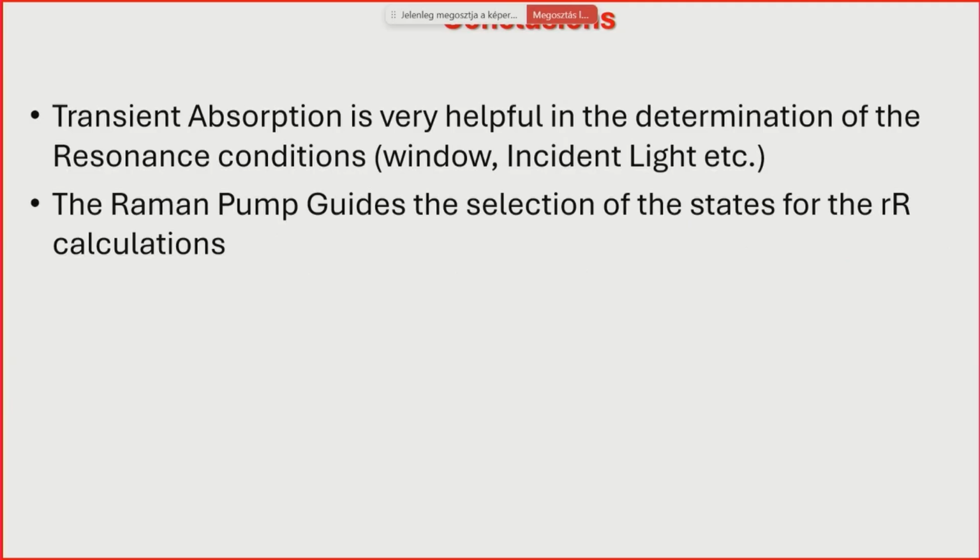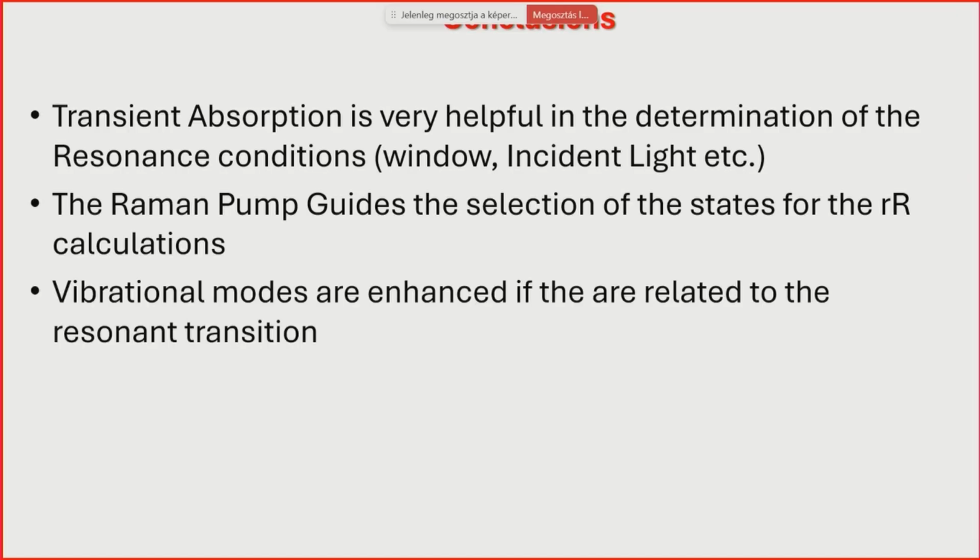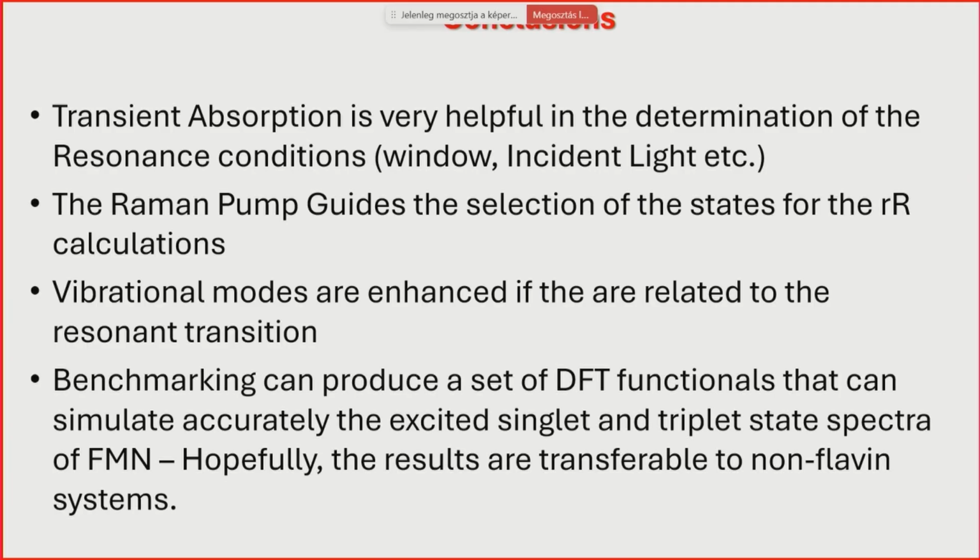So transient absorption is very helpful in the determination of the resonance condition. The Raman pump guides our selection of the resonance states. The vibrational modes that are enhanced are the ones that pertain to the resonance transition, and benchmarking can produce a set of functionals that can simulate accurately the excited singlet and triplet spectra of FMN. And hopefully, these results are transferable to other systems.